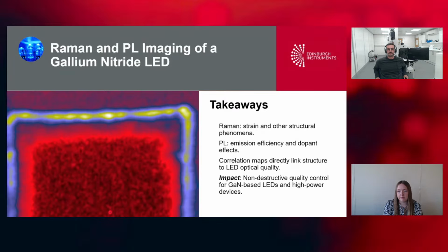Yeah, absolutely. So the lasers were different in this case. One was a red, one was a UV, and the objectives were different. One was a 0.9 numerical aperture, and the other was lower. So they will naturally have different focal points, and we have to correct for that in the software. We do correct for chromatic aberration within the software, so they'll be on the same Z plane essentially. As for the spot size on the sample, they probably will be a bit different using different lasers and objectives. But this is where we'd recommend doing everything sequentially with the UV laser and the 800mm spectrograph.